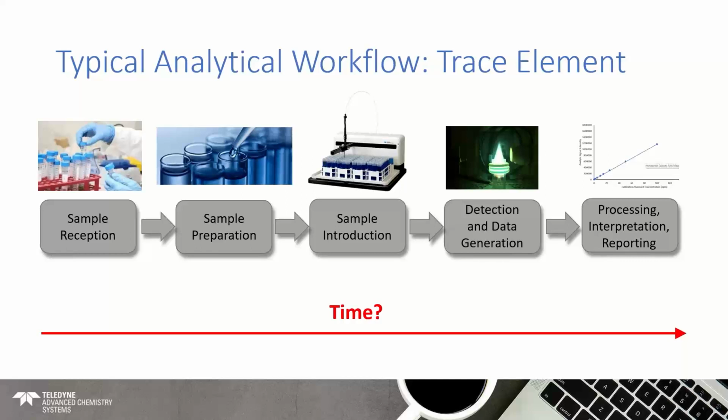Now that amount of time is going to depend on the kind of samples that you have. So a lot of that's going to factor into the sample preparation side. It's going to be determined by the number of samples you have, the analytes that you're interested in. You might only be interested in, say, 2 or 3 analyte elements. You might be interested in 50 of them. So there's a large number of variables here that will determine the amount of time that it takes between sample receipt and your data at the end of it.